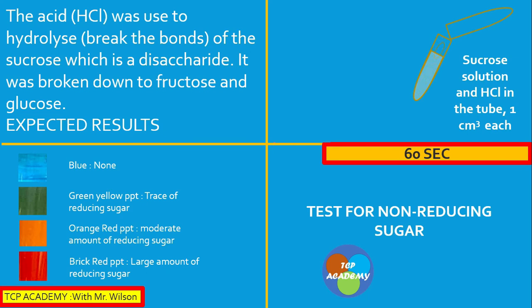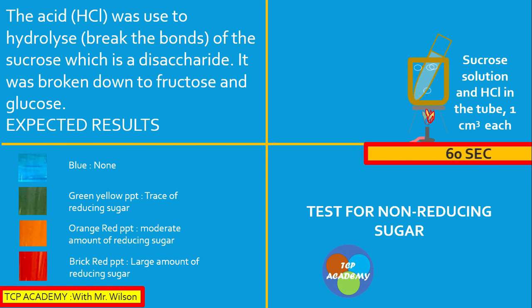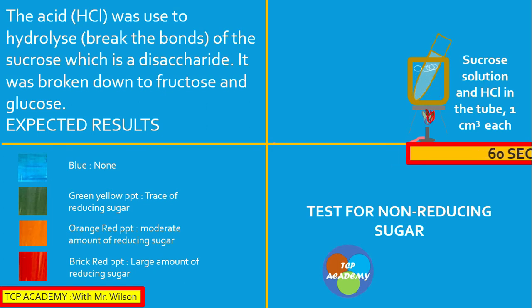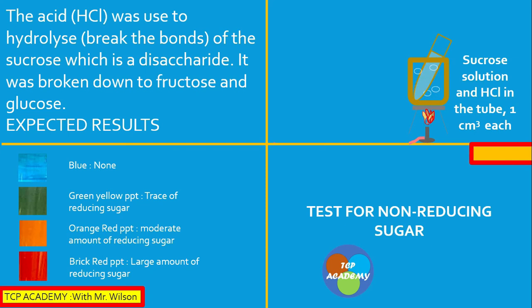We continue the experiment by applying heat for about 60 seconds — one minute — with the mixture of sucrose and hydrochloric acid. Our intent is to break the bonds in this disaccharide and reduce it to the monosaccharide state, so we can then test for reducing sugar. We are working with sucrose (table sugar) to confirm it contains reducing sugar once its bonds are broken.